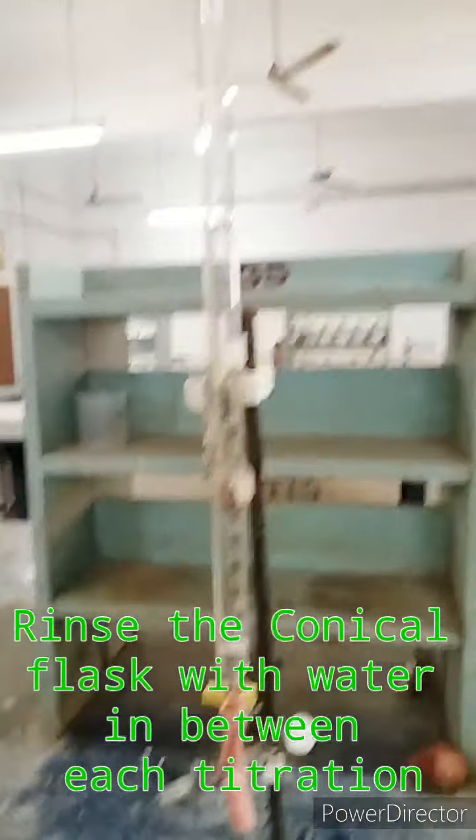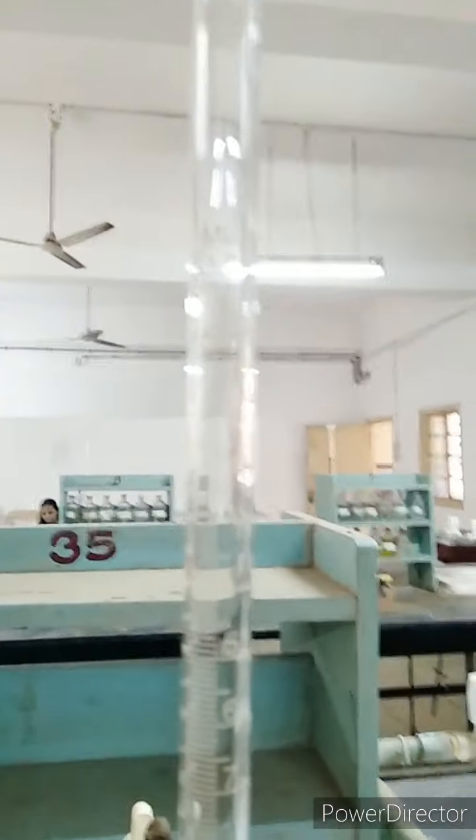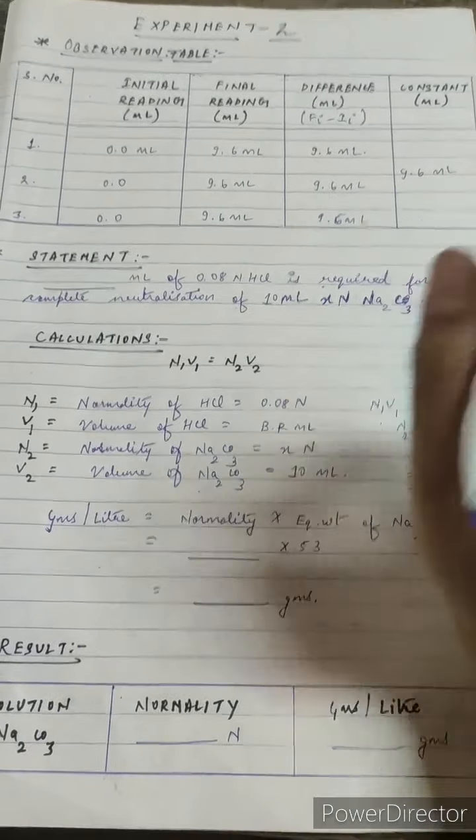Again you have to fill the burette up to the 0 marking level, and then again titrate it. You have to titrate till you get a constant reading. Suppose our other two readings are also this. So our concordant or consistent reading is 9.6 ml.